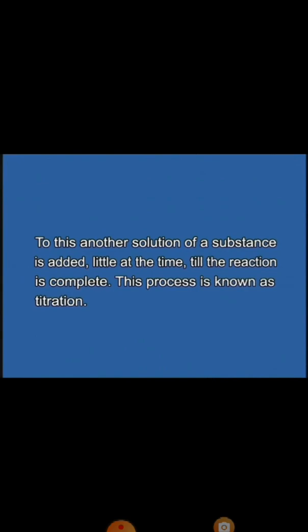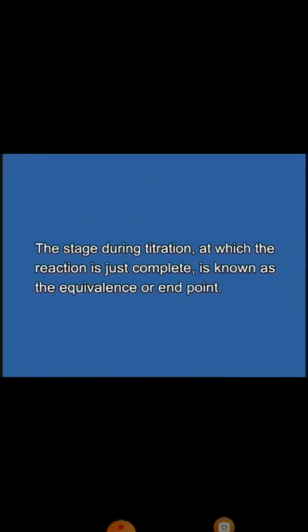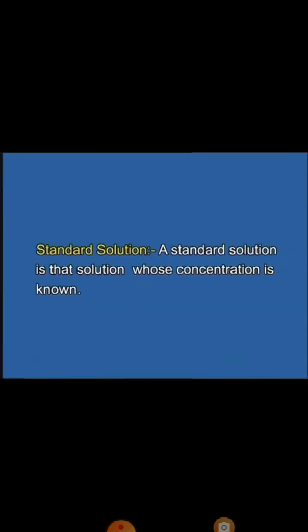As you already know from 11th Science Standard, the stage during titration at which the reaction is just complete is known as the equivalence or end point. Now we will learn what standard solutions are. A standard solution is a solution whose concentration is known.